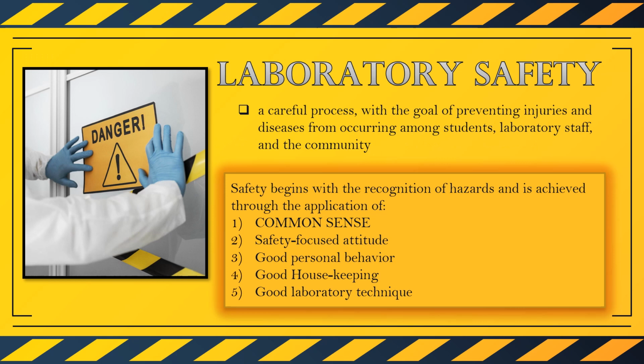Working inside the laboratory poses almost all forms of risks for the medical technologists. And since a laboratory houses a variety of potential dangers or hazards, such as chemicals, especially under the clinical chemistry section, biological agents in general, which can cause infections, and mechanical hazards due to equipment. By understanding, class, the principles of laboratory safety, individuals can work more effectively and efficiently while ensuring and promoting a safe working culture and environment.